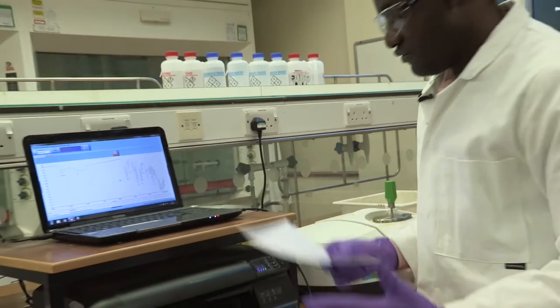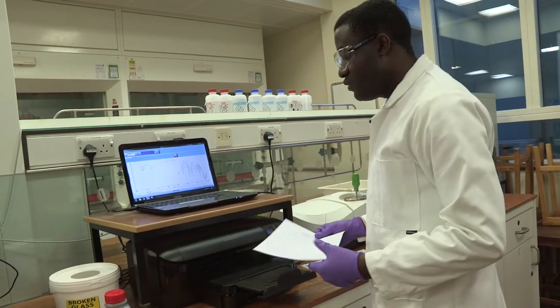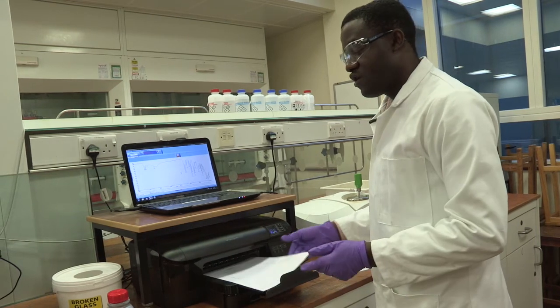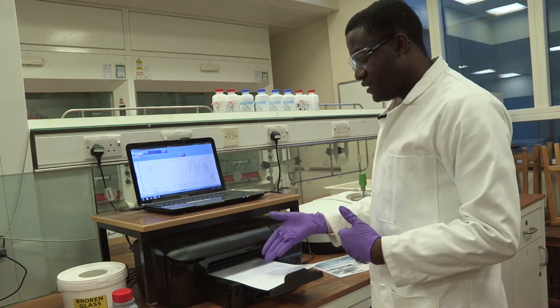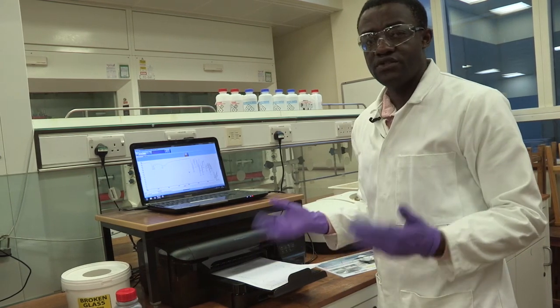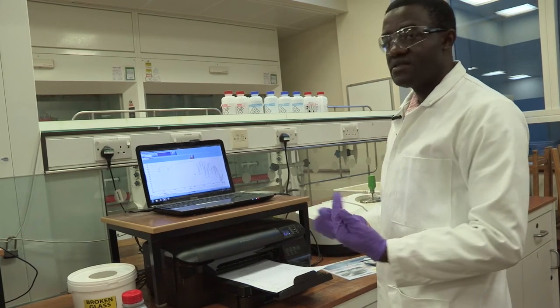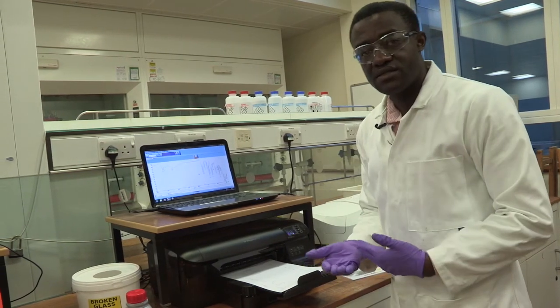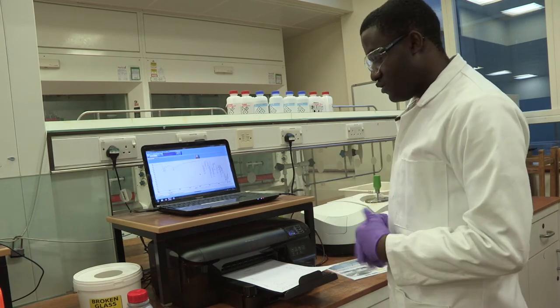But just remember that IR alone cannot be the only way you verify if the compound you've made is actually what it is, because this can be correct, but your sample will have impurities. So you also have to characterize and look at elemental analysis to make sure that your sample is pure and it's what you want it to be.